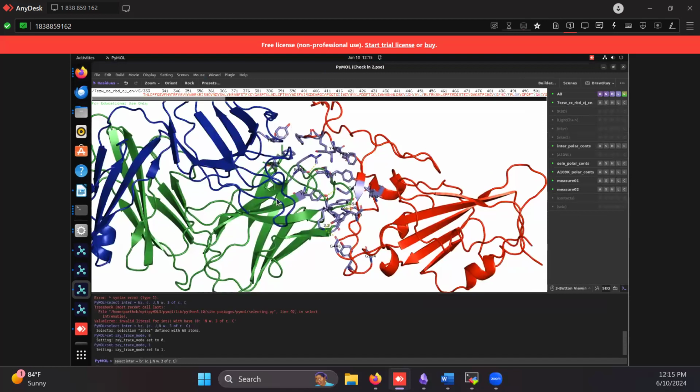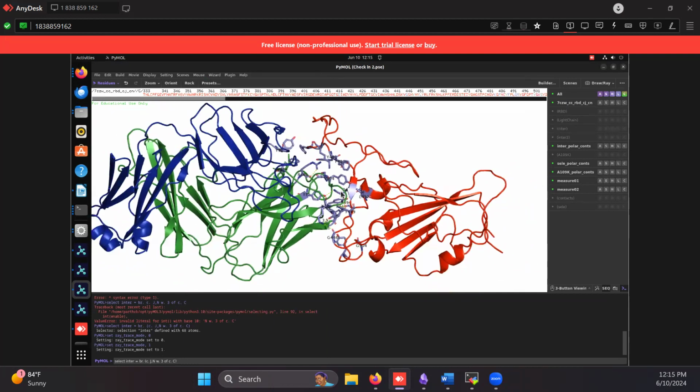For this selection, like how I got an interface residue, basically, is the structure from Anu? No, this is actually part of my protein engineering course. We had to design an antibody. Oh, I see. It's because Anu is working on the SARS-CoV-2. Oh, I see. So this is from my protein engineering class.